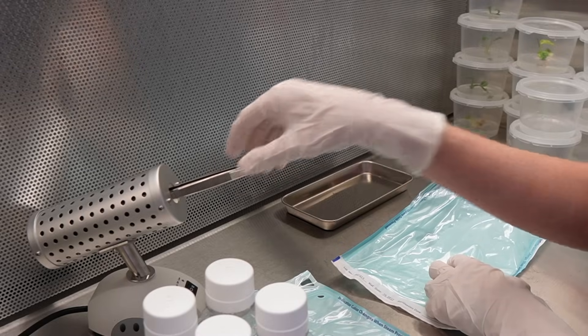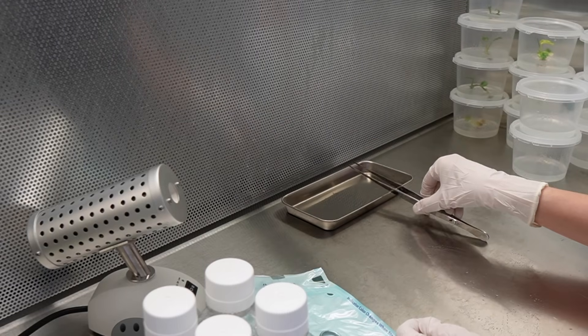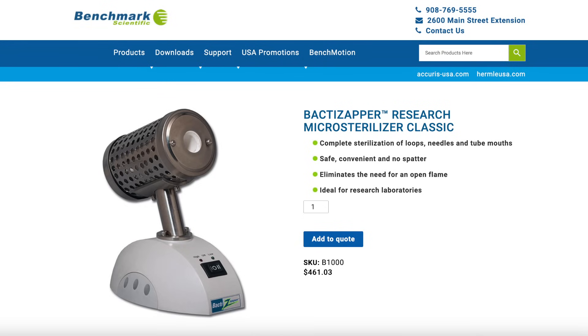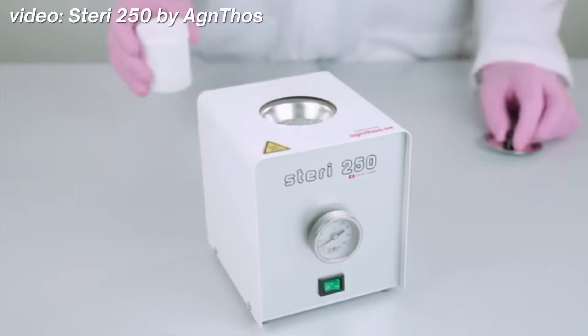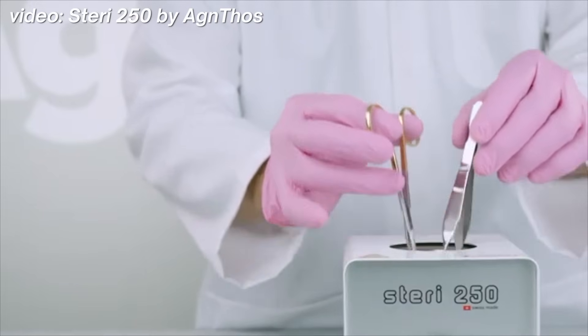The next piece of equipment that you need for tissue culture is a tool to sterilize your forceps and your scalpel or scissors in between handling different cultures so that you don't cross-contaminate them. This particular tool is called a Bacti zapper. This was also purchased new for the low, low cost of $461.03. There is a warning on this product that warns you against using it for anything except for sterilizing inoculation loops, which is clearly not what I'm using it for. So I don't know if I can wholeheartedly recommend this purchase. Instead, I would recommend picking up a glass bead sterilizer — the glass beads are hot and the heat kills bacteria and spores. I will probably pick one of those up at some point in the next year.